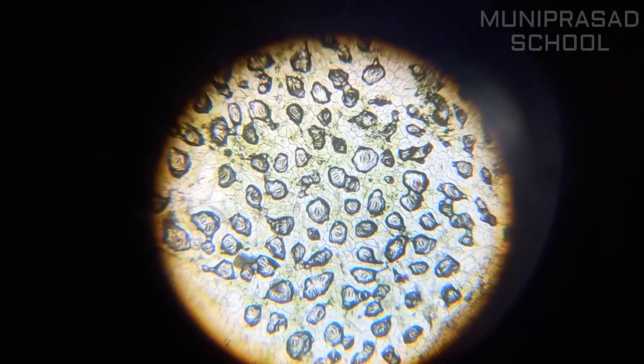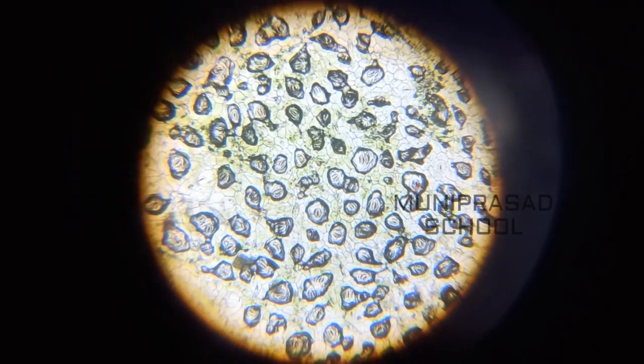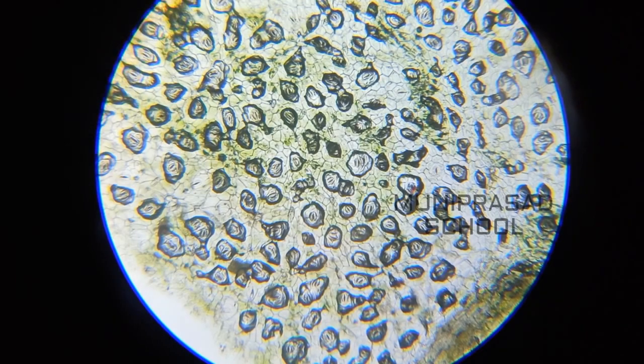We see a number of small pore-like structures in the epidermis of the leaf. These are called stomata.